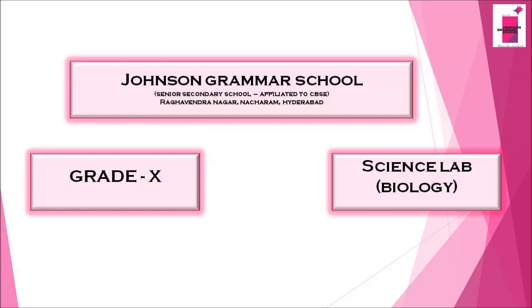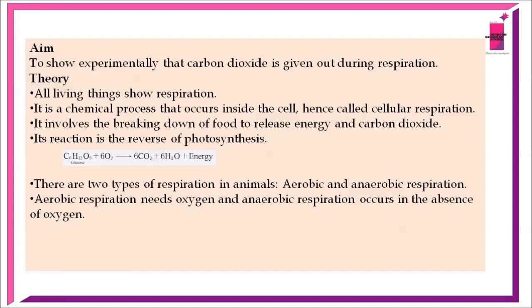So in this video, we will discuss the experiment, the release of carbon dioxide during respiration. Aim: to show experimentally that carbon dioxide is given out during respiration. Theory: all living things show respiration.